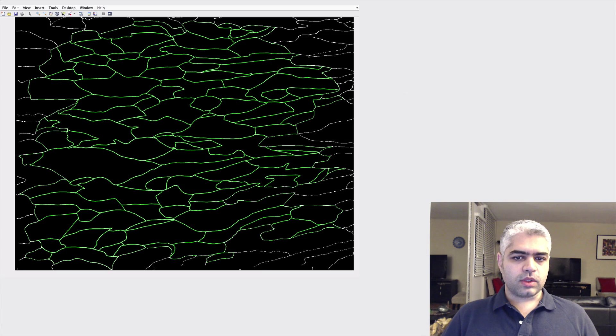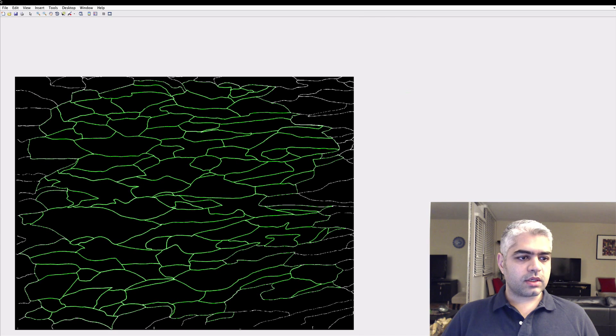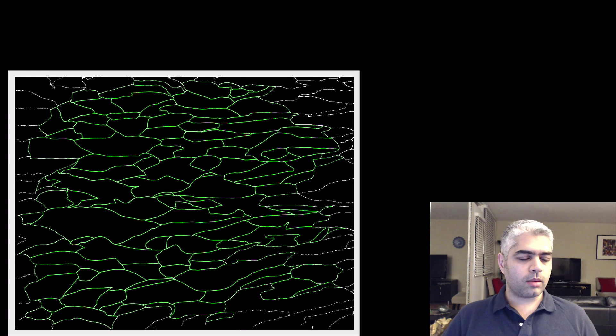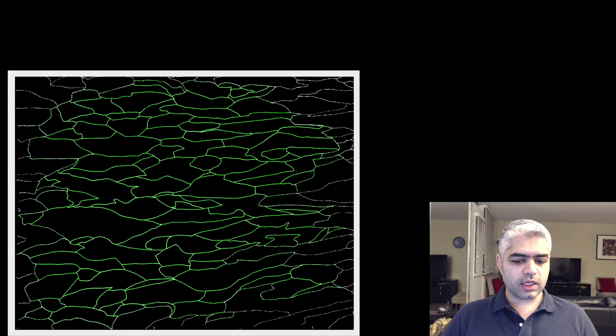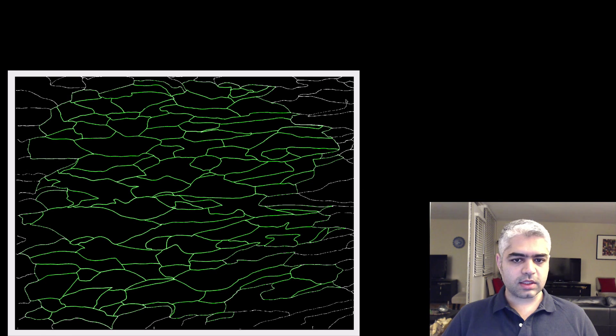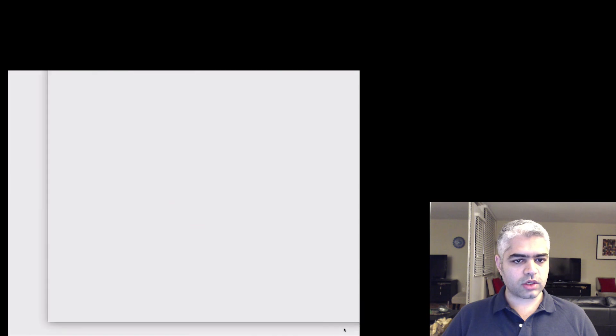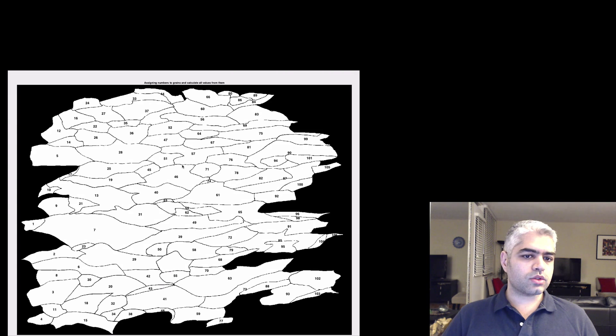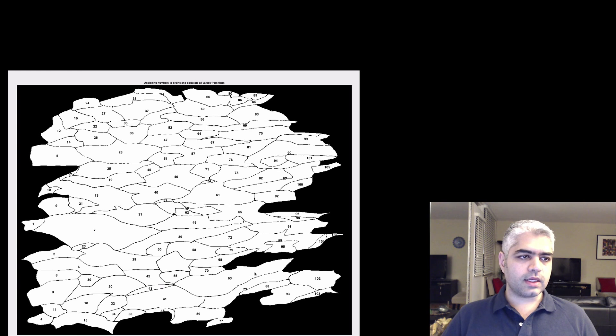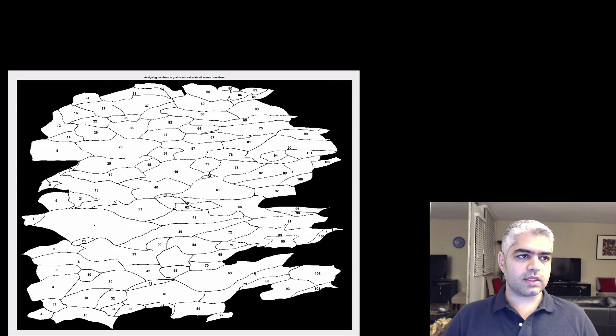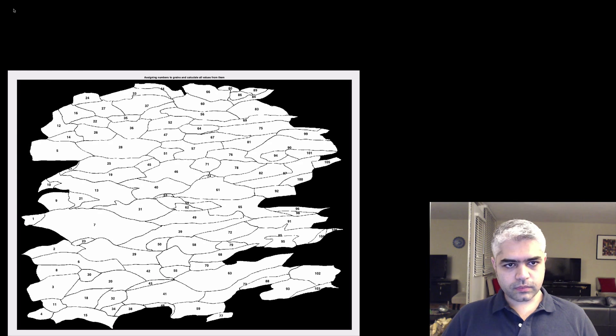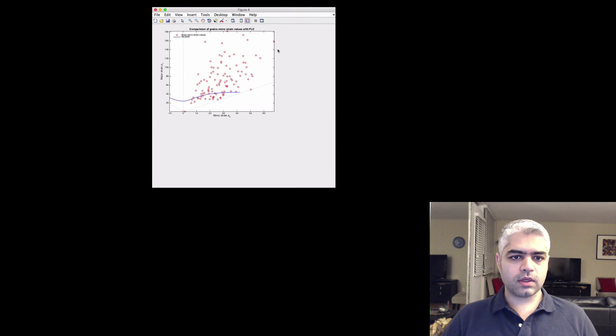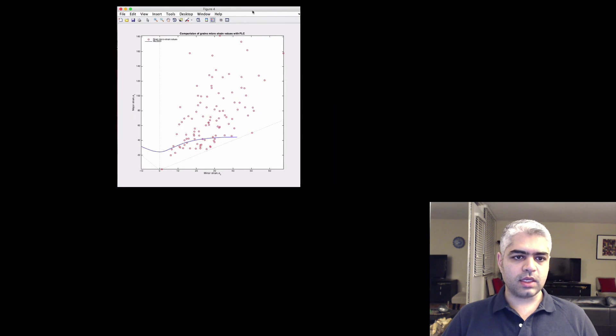So these are the grains that are detected. Based on the standard, we need to omit the grains that are partially measured or detected inside the microstructure. Then it's going to assign a number to each of these grains. Then it's going to calculate the major and minor strains as you can see here.